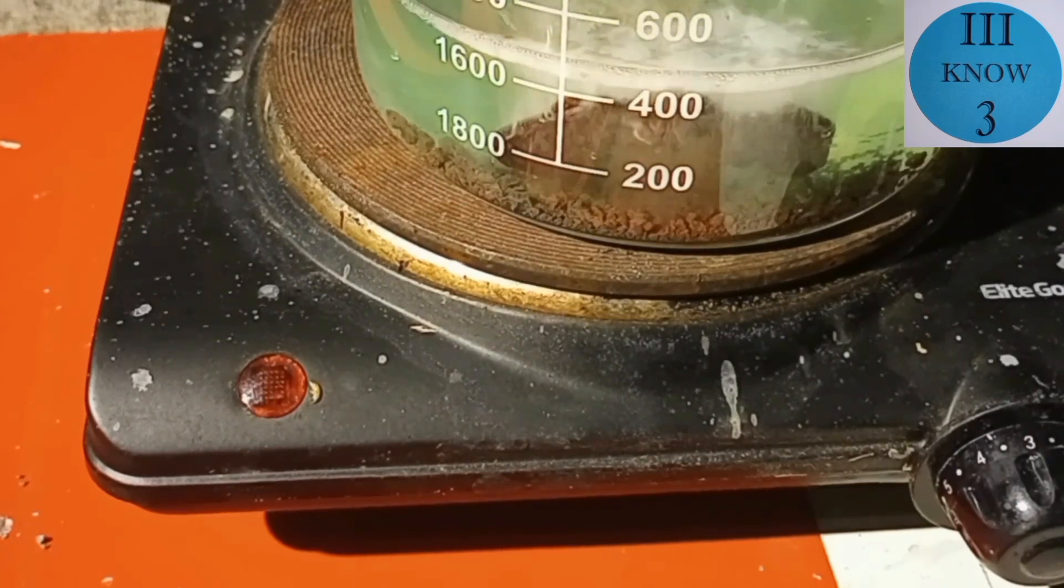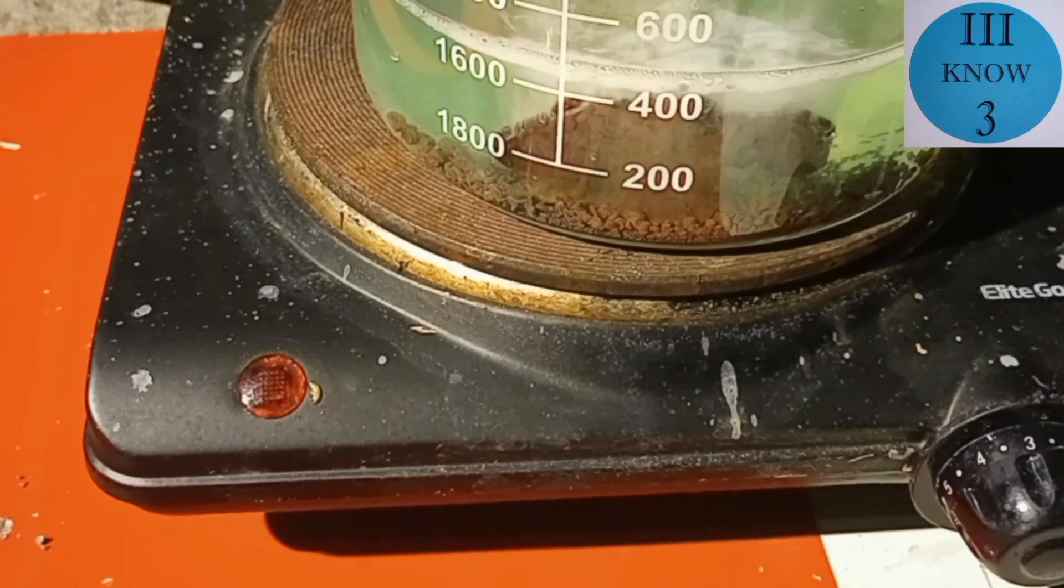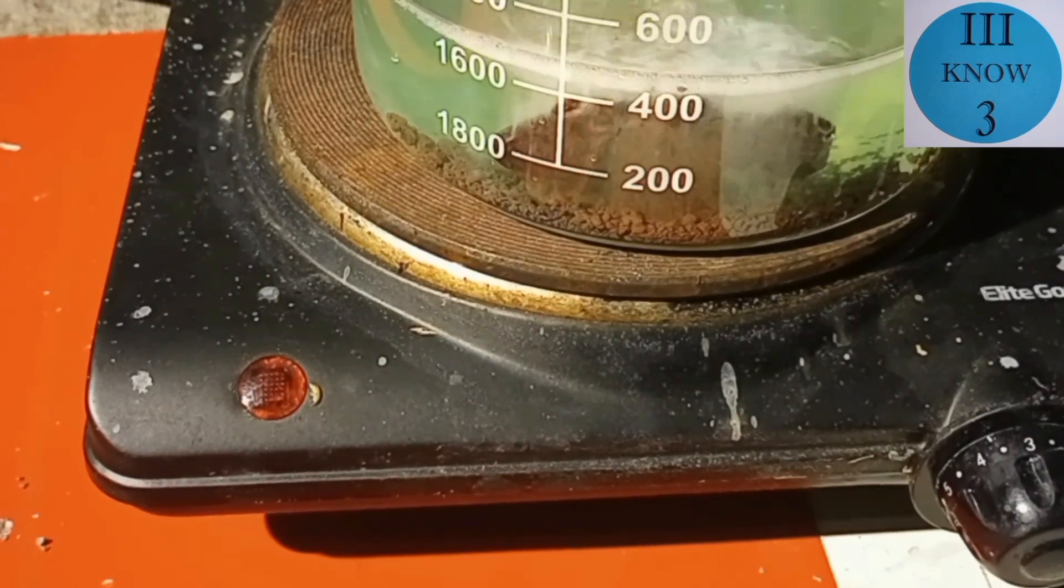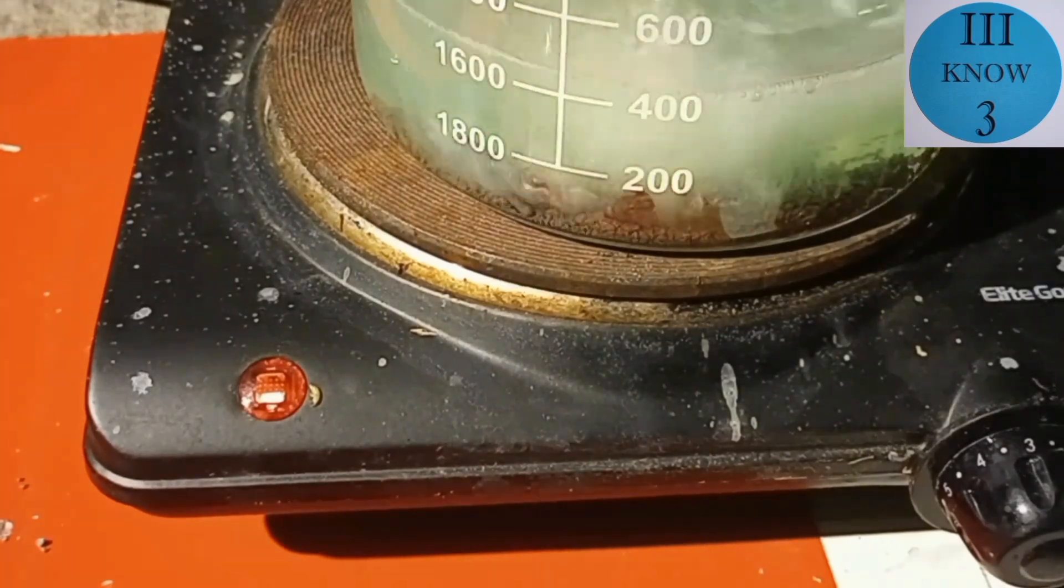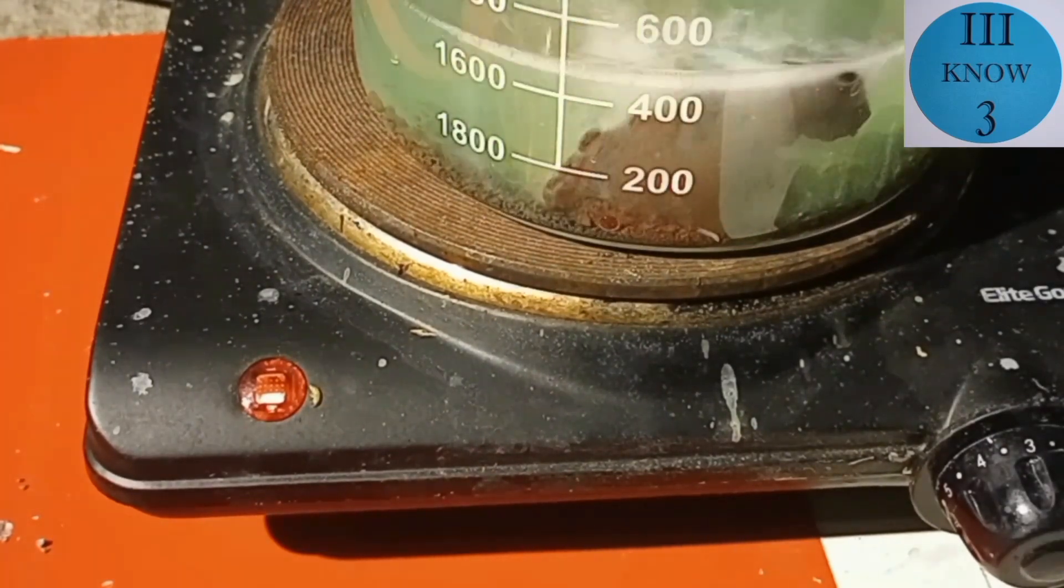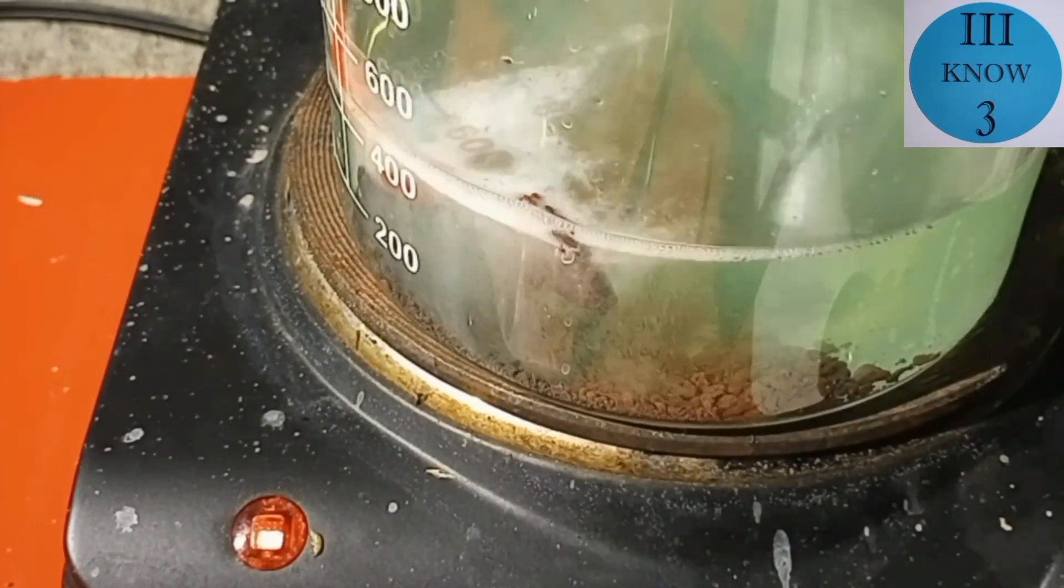Nickel and copper do not dissolve well in acetic acid on their own. For the copper I added hydrogen peroxide to get it to dissolve and for the nickel I used electrochemistry to make the nickel acetate.